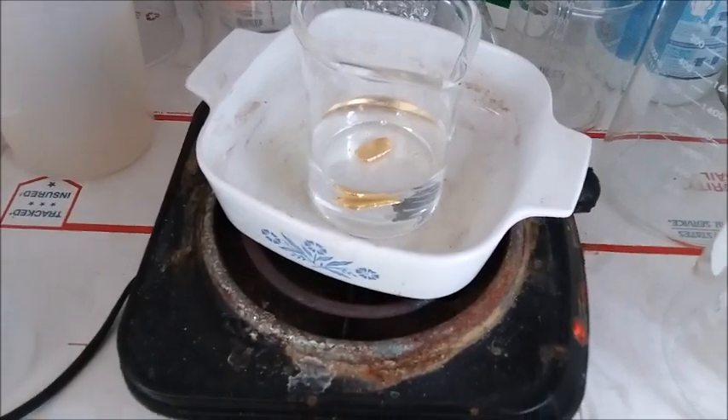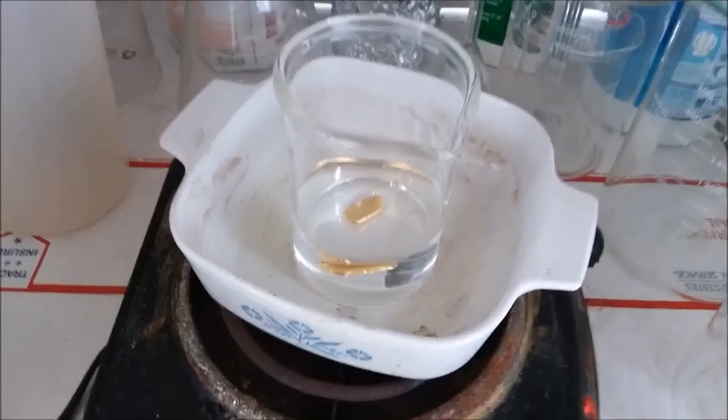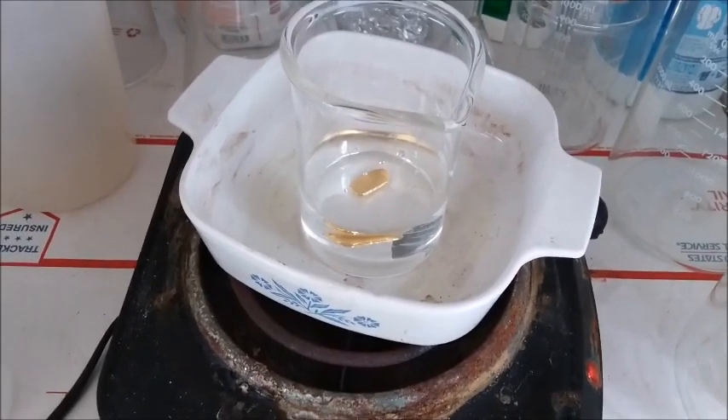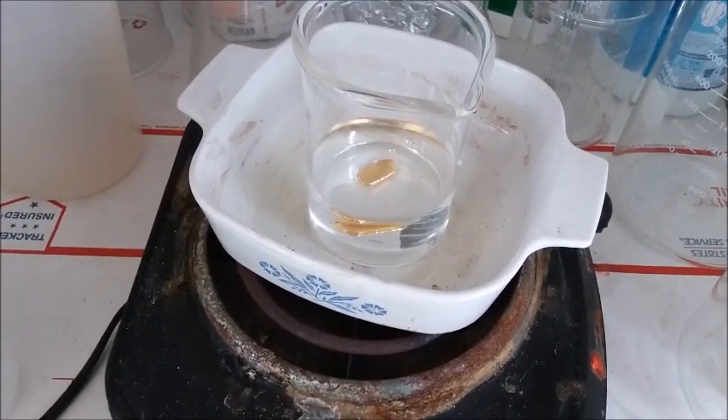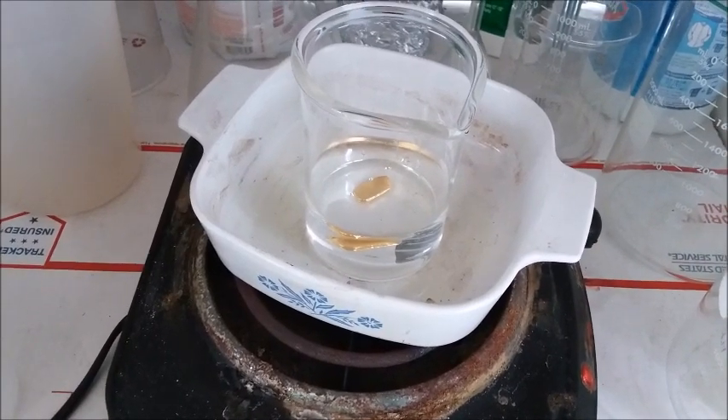Here we are, giving it a quick boil in a dilute sulfuric acid solution. It hasn't come to a boil yet — just warming up. That should remove any residual borax stuck to it, and then it should be a nice clean piece of gold.